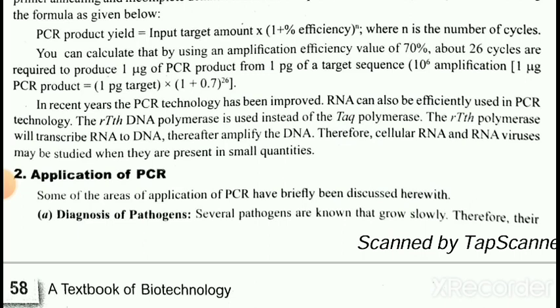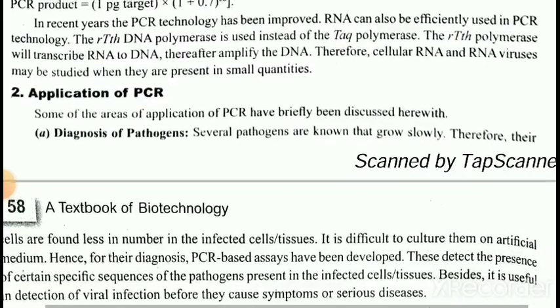Therefore, cellular RNA and RNA viruses may be studied when they are present in small quantities. 2. Application of PCR. Some of the areas of application of PCR have briefly been discussed herewith.